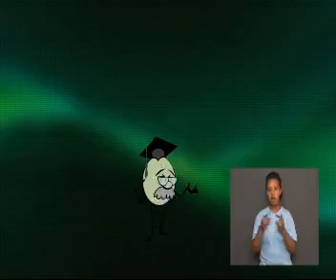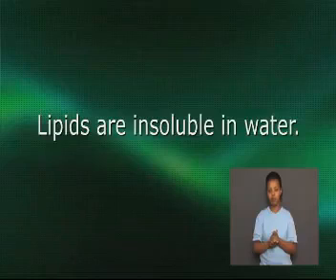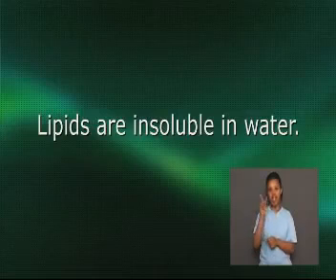Let's get back to our lesson. Hello again, everyone. If you said that the lipids form a layer on top of the water because lipids are insoluble in water and therefore cannot dissolve, you are correct. Good work. This brings us to the end of our lesson.